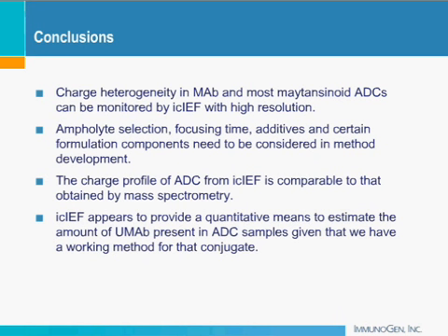And the charge profile from ADC that is generated using ICIEF is very comparable to that obtained by mass spectrometry. And then also, lastly, the application of ICIEF, where it is very useful to look at the unconjugated antibody levels in an ADC sample.